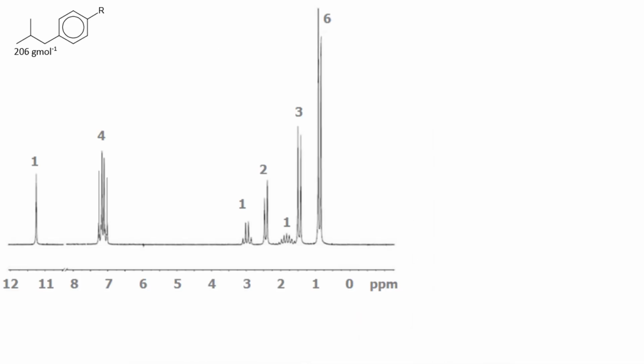So that's the essential information we've got, and what we're going to do is simply start by looking at the bit of structure we're given and see if we can identify the peaks that correspond to that part of the structure, and then we just take them out of the equation and see what we're left with that's left to account for.